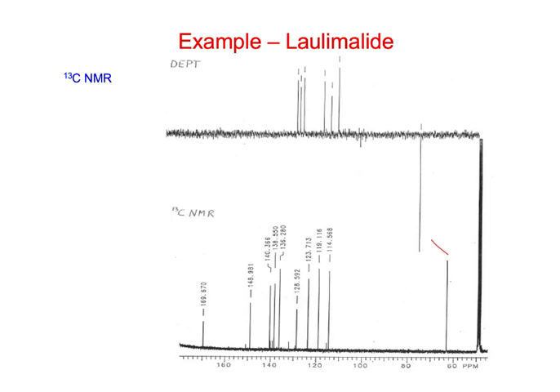Is it from a marine metabolite? Yeah, it's from a marine tunicate, a sea squirt. And it wasn't a very complicated structure, but the interesting part was that most of the ascidians tend to have metabolites that are usually nitrogenous, and this one wasn't, so that made it a little bit unusual. So in this one, this section right here is the same as this section right here. So scales are just off a little bit.